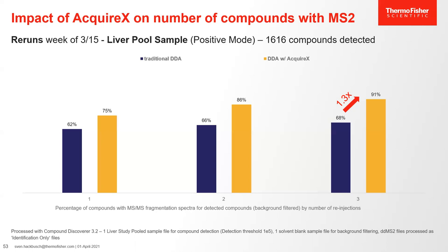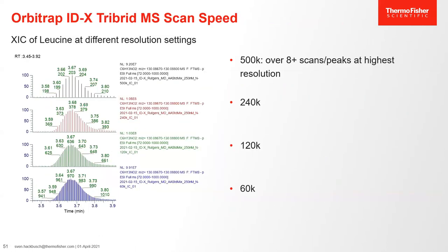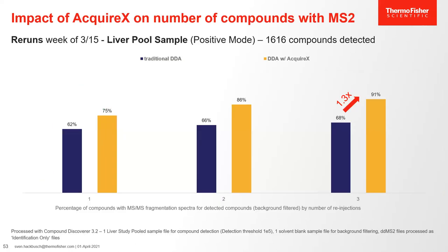Now, you're saying, well, Craig, why are your numbers going down? As we go lower and lower into the sample, the return on investment drops, just because as the features get smaller and smaller, it takes a little more time to accumulate them to get a good quality signal. So we can see with one reinjection, we go up about 10%. Two reinjections, about 20%. And the third reinjection is probably about your final point. You get about 28, 29% return. So if you want to discover more things, you turn on AcquireX and it says, okay, I keep track of what I saw and I don't see it again. Kind of a nice feature on our instruments.